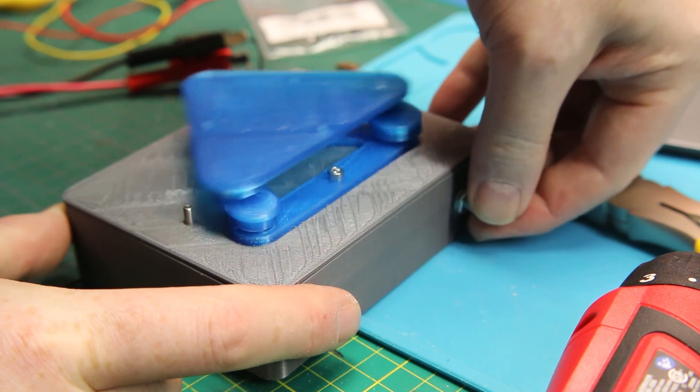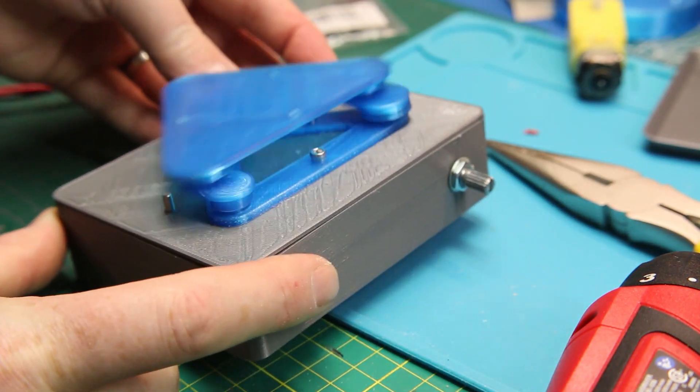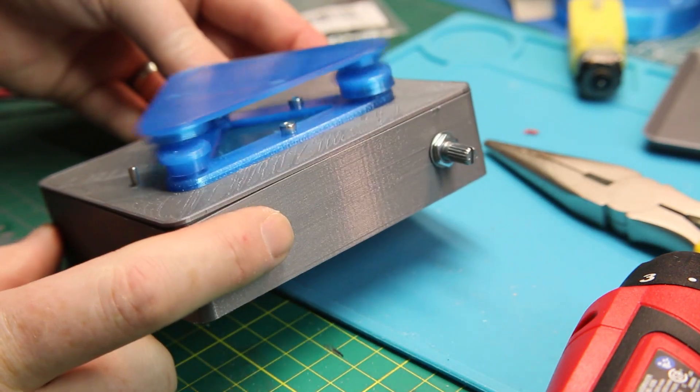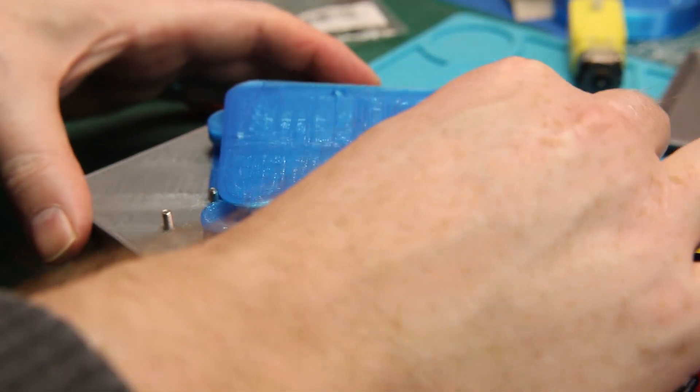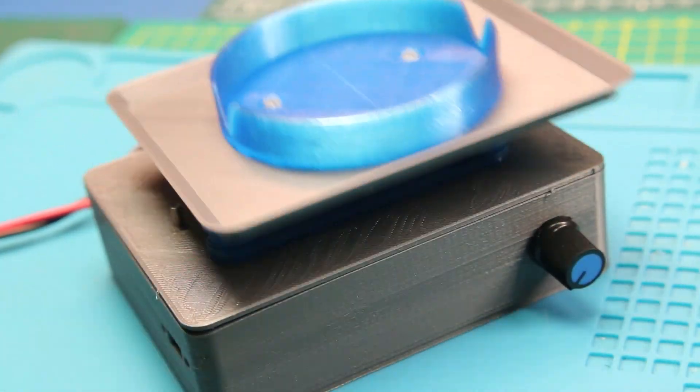You can put a jar, a beaker, a flask, whatever you want on the top, and it will agitate the solution at whatever speed you set it to. Works just perfect.